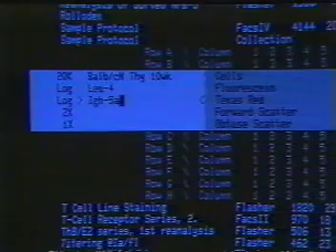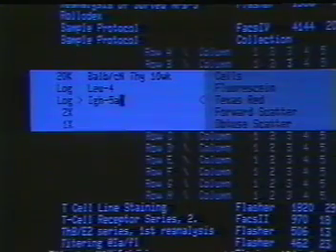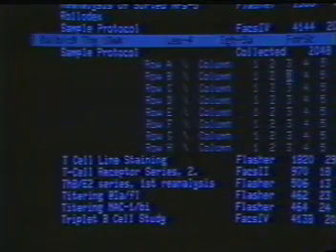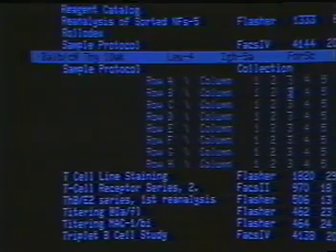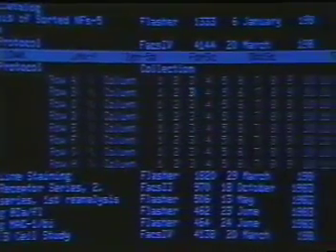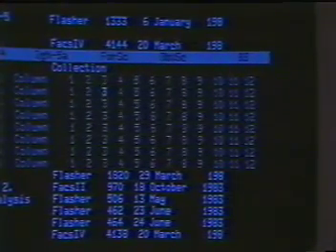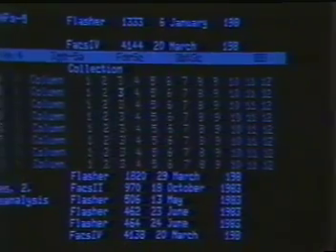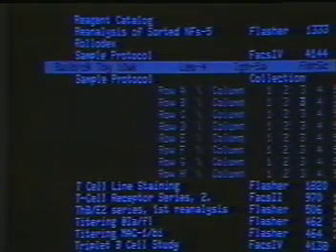Watch the screen now as we press Execute for sample B3. As soon as the white label box disappears, you know the magic secretary has started collecting and cataloging data. The new analysis card appears as a gray sample line below the analysis drawer label. The sample number can be found on the right edge of each sample line. When the data collection is complete for a sample, the sample number glows brighter on the matrix.